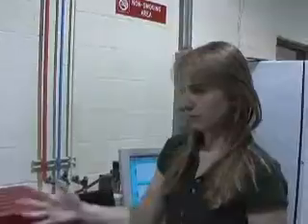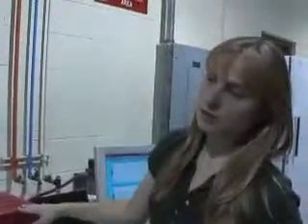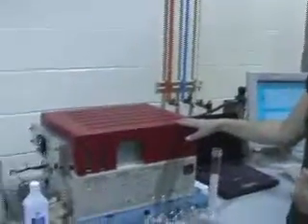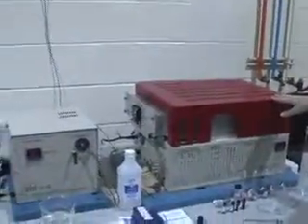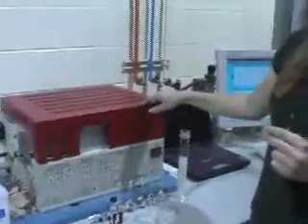Another step in the sample testing process is to determine the amount of ethanol in the fermentation at each day of the test. This is our gas chromatograph, which is similar to the liquid chromatograph from earlier, but it actually combusts the materials and analyzes the gas phase. Works much better for ethanol than for sugars because ethanol is volatile, it burns much more easily.